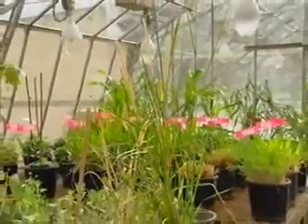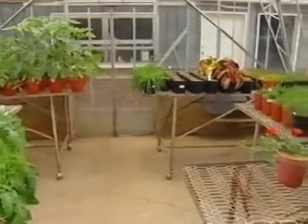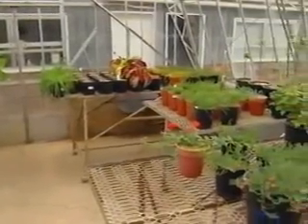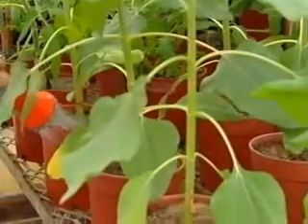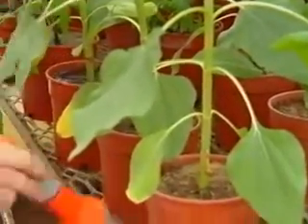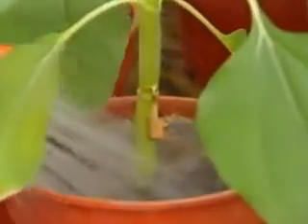Another important point is that under glasshouse conditions, we can control the humidity in the glasshouse. Generally speaking, a dry glasshouse will harbor fewer microorganisms. The hygiene in the glasshouse can also help to keep plants clean. As a general rule, plants destined for micropropagation should not be watered overhead.